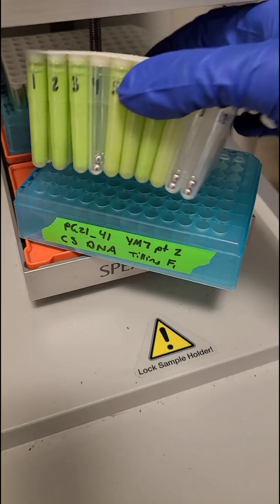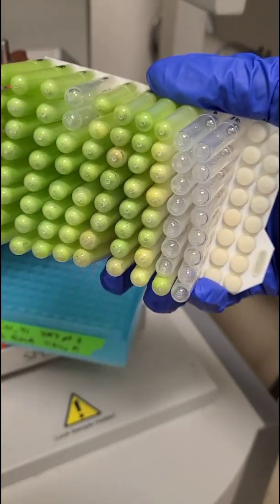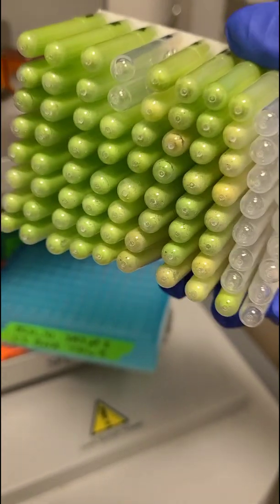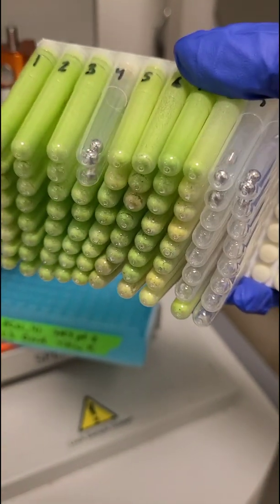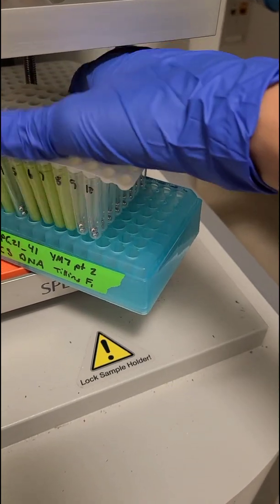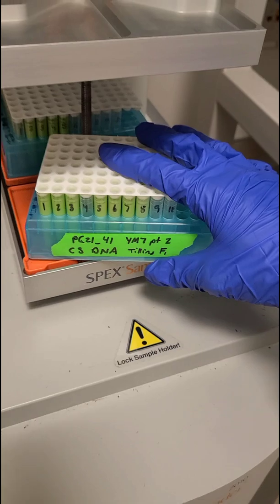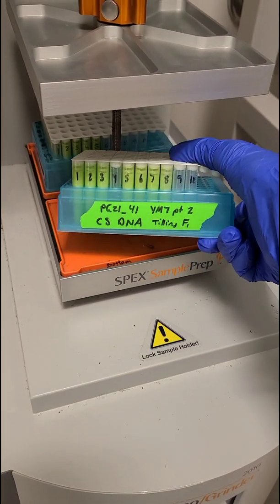It looks pretty good. That one's empty so it should be like that, and you can tell that there is some discoloration — those are actually older leaves so that makes complete sense. Younger leaves are better for DNA extractions, but as long as there's some green you can usually get some DNA, so I'll probably extract these tomorrow.